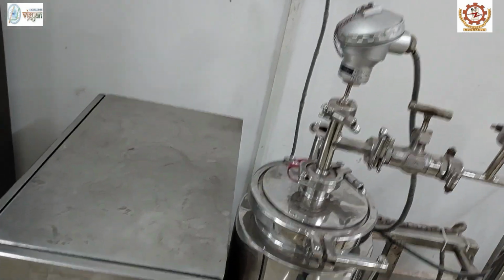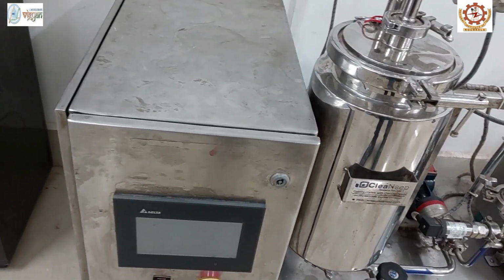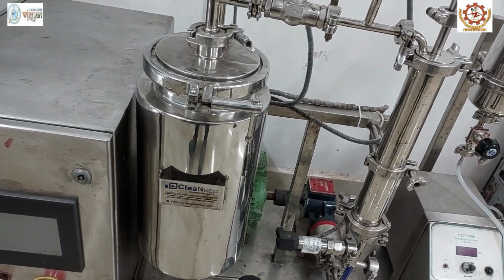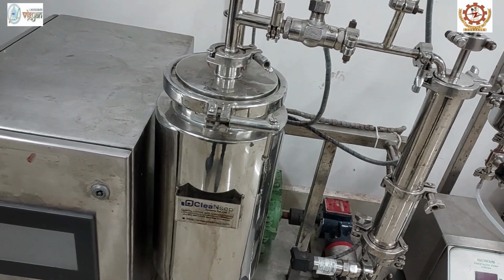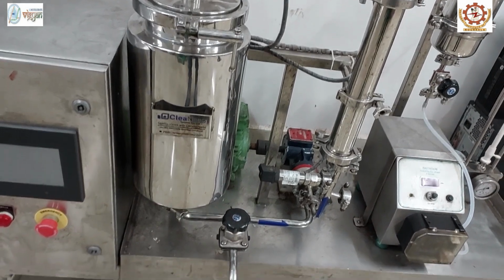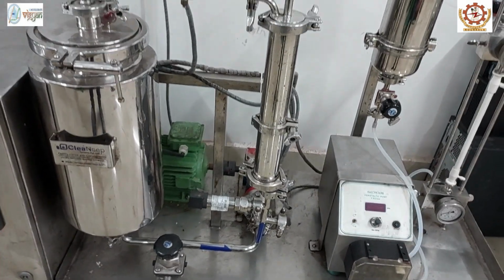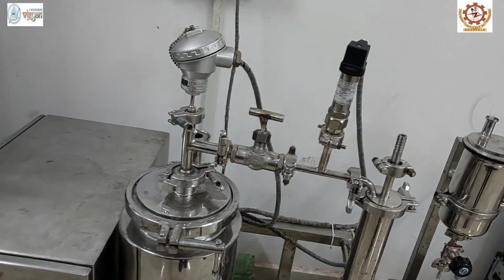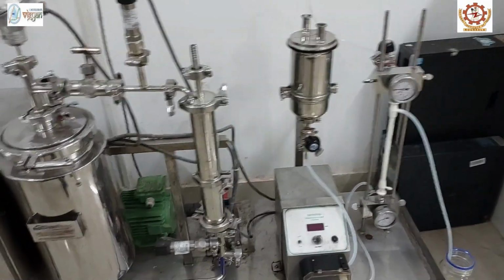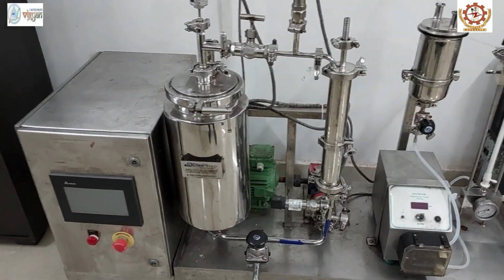The food industry application of reverse osmosis includes drinking water purification, whey and milk pre-concentration, alcoholic beverage de-alcoholization, and juice concentration. However, higher energy consumption, fouling tendency, and high pressure are some of the disadvantages of reverse osmosis process. As I have already said, this membrane filtration system is divided into two different parts.